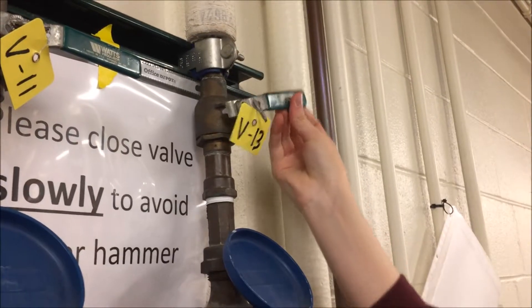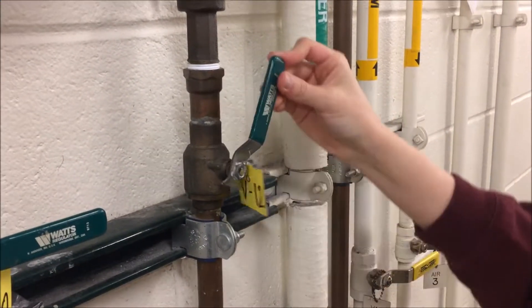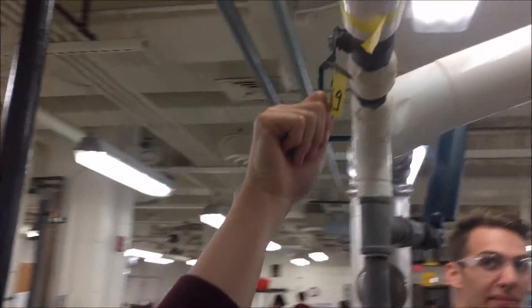Turn on the cooling water for heat exchanger 3 by opening V13, V12, and V14 near the wall. Next, open the green valve V19 to roughly 30 degrees.